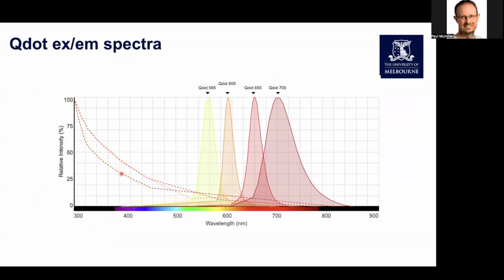So this is what the excitation and emission spectra look like for these. You'll see they have very similar excitation properties, but the emission spectra again look fairly like standard fluorophores, fairly narrow emission spectra on those.